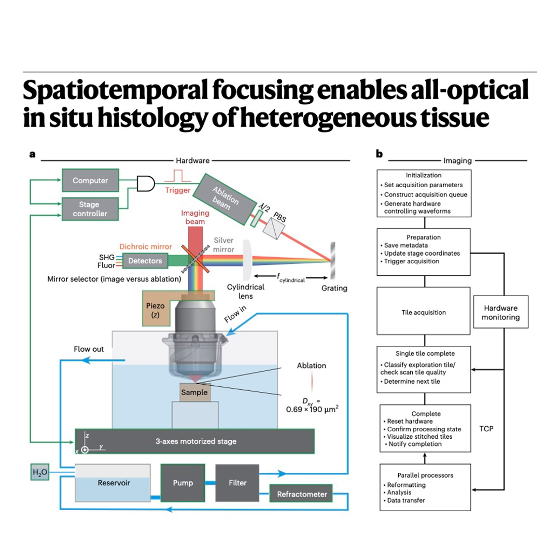Standard lab gear. Okay. But instead of having a person read the display, they aimed a simple USB camera right at the refractometer's digital readout screen. Seriously, a camera watching the screen. Yep, cheap and effective. Custom software then analyzes the image feed from that camera in real time. It uses image processing to read the RI value off the screen. That's surprisingly low-tech, but clever.